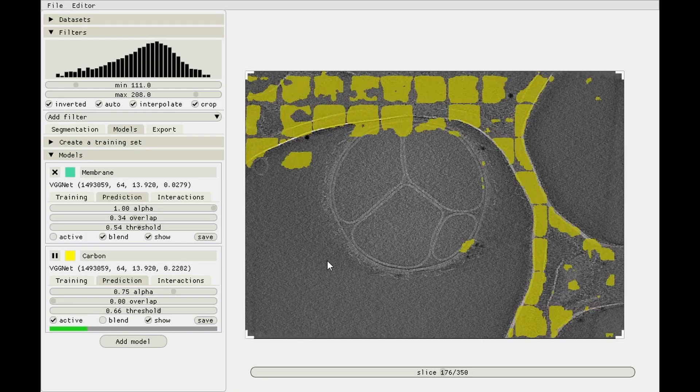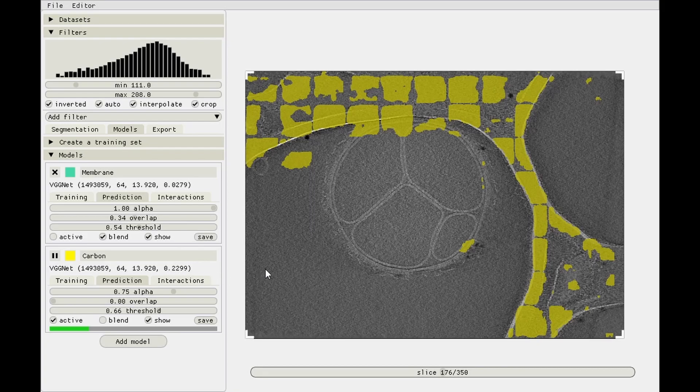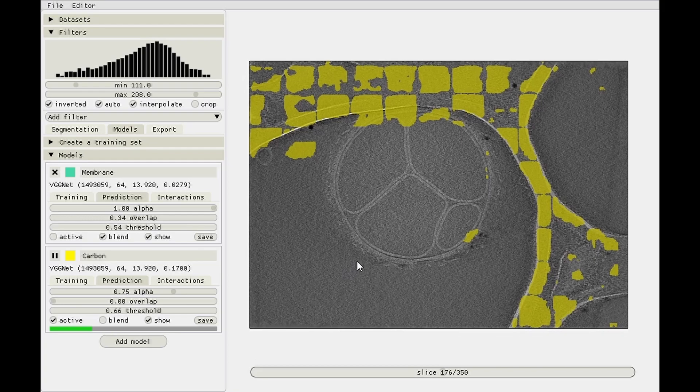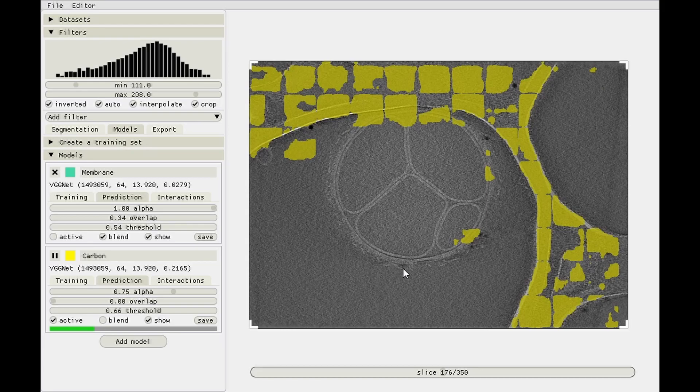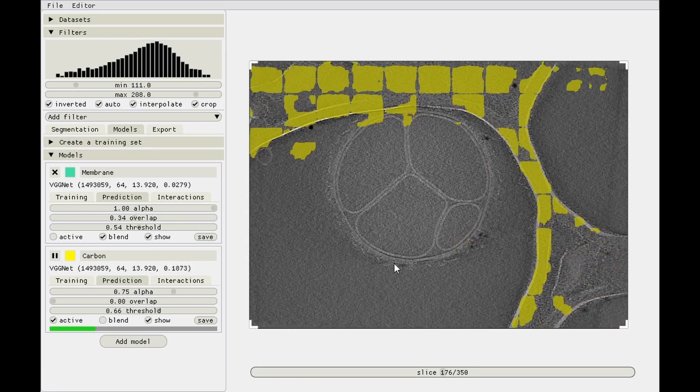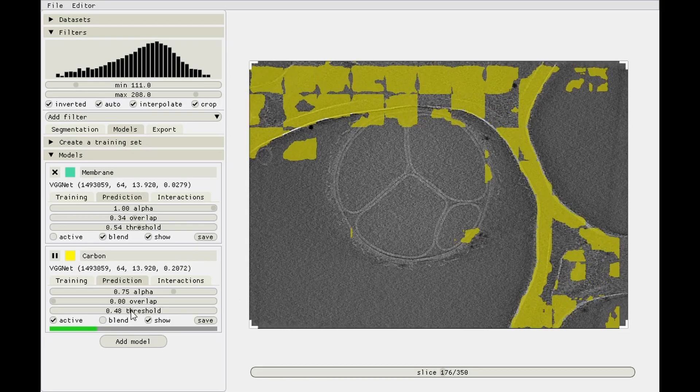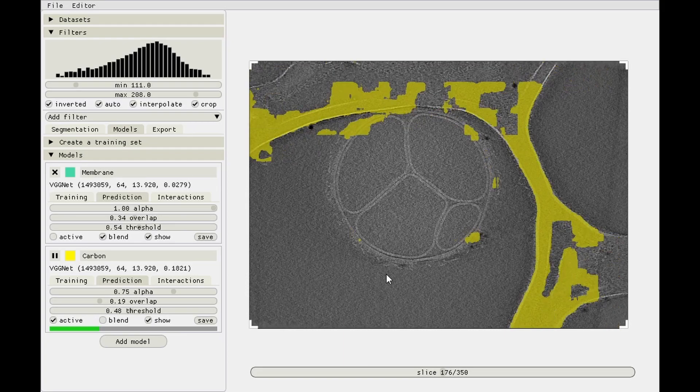Let's change the box size a little bit to see more boxing artifacts unfortunately. Let's make it lower then. Alright, fine. But still the loss is 0.22, let's not bother it too much because we are slowing down the training process. Let's just wait for a bit, but that will make the video boring so let's not wait.